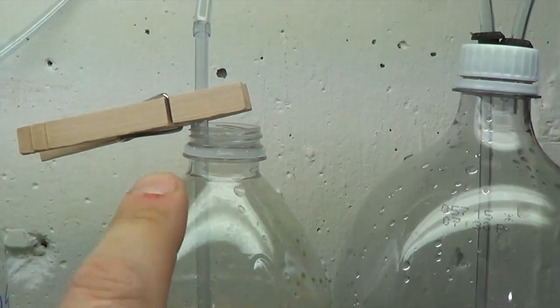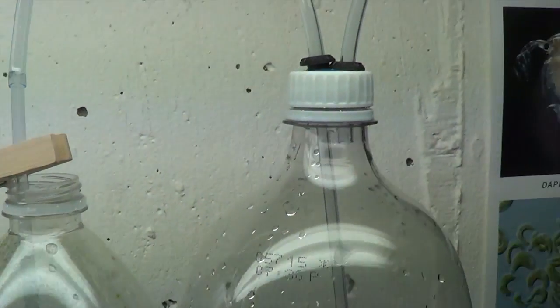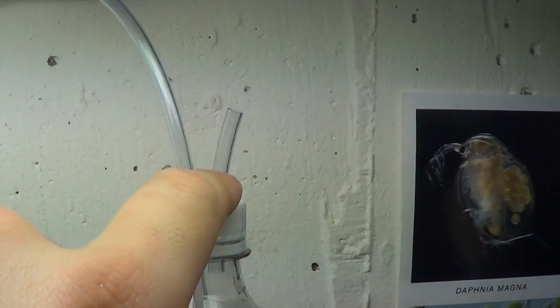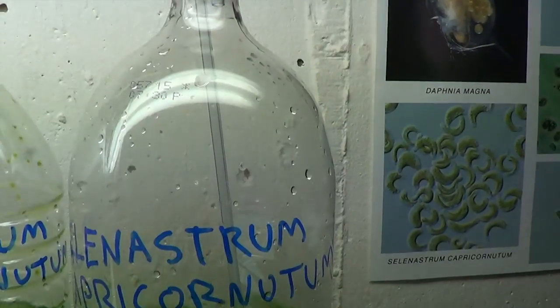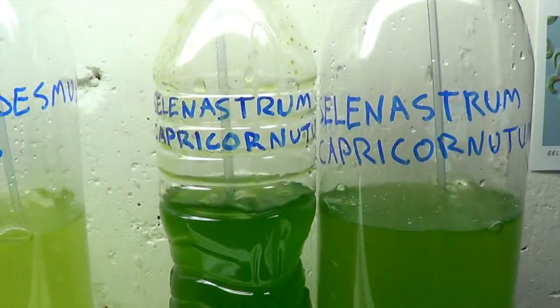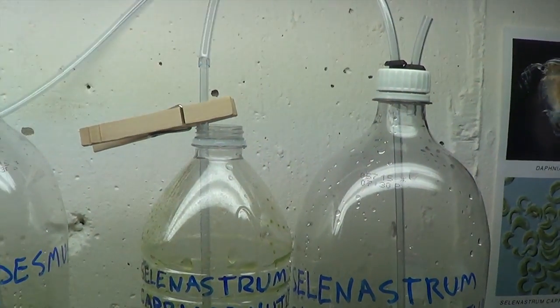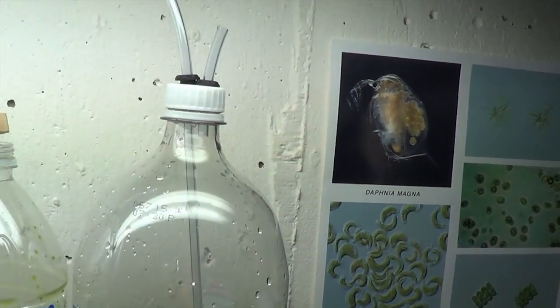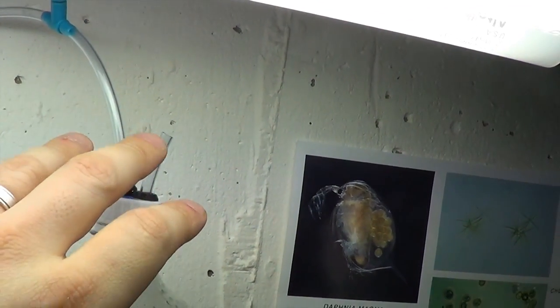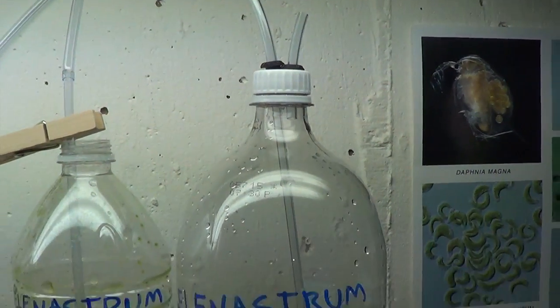And this is an open top. You could put a cotton ball over the top if you wanted to. This one has a snorkel to allow the air pressure to escape out the other end. All in all, if this one was completely filled, it would be bubbling out and spitting algae all over the place. If this one was almost completely filled, it wouldn't have a problem because this would allow the water to drip back down into that bottle.